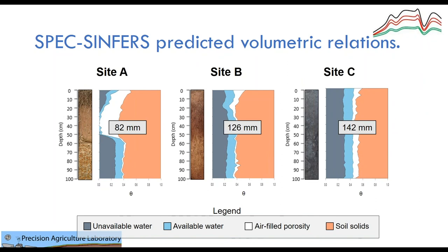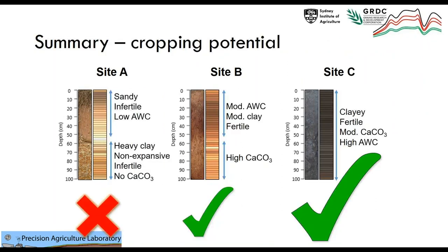And they made, of course, a study where you mix all these things, so you can predict using the NIR spectra and using the XRF at different depths, using the EPO, or this way of taking the water out of the spectra in situ, predicting many different properties, doing the spectral inference and then predicting some other properties, and give some advice in the field.